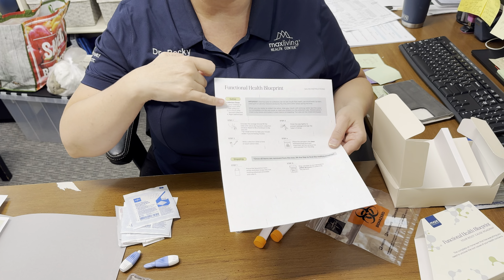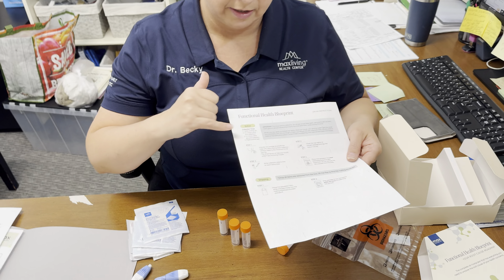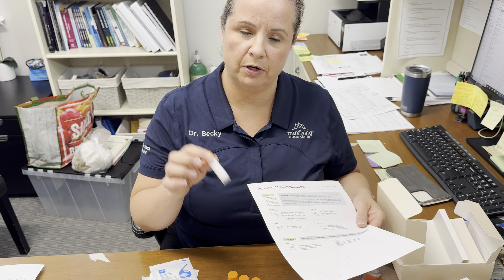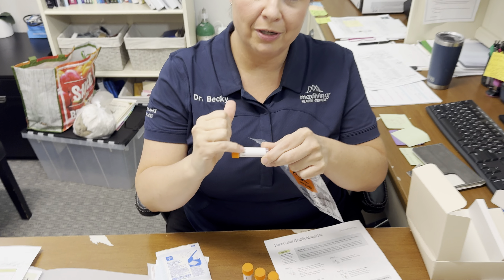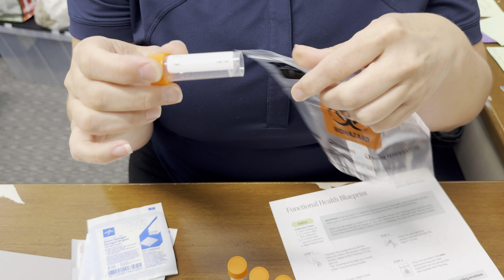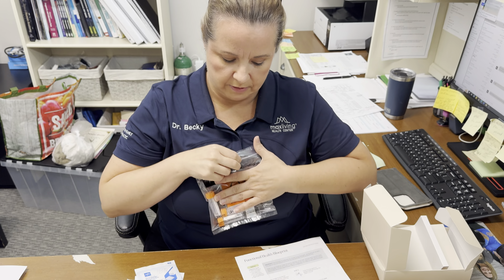The second tube is two to three to four hours later, same procedure. The next one is three to four hours after that. The final one is right before you go to bed — try not to eat anything within an hour of filling the tube, and don't brush your teeth before collecting the first sample. Each time you're done spitting, put the tube in the bag and keep these in the freezer until you're ready to send it. Write the date, name, time collected, and circle AM or PM on the tube before putting it in the freezer, since the ink stays on better before freezing.